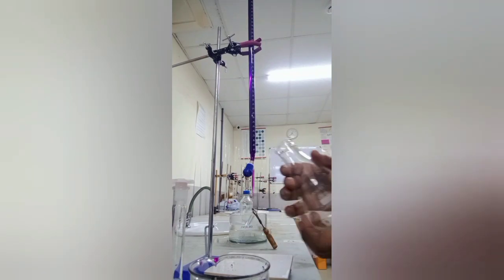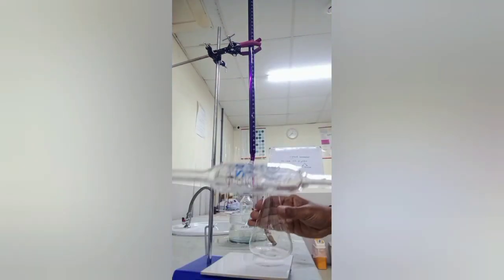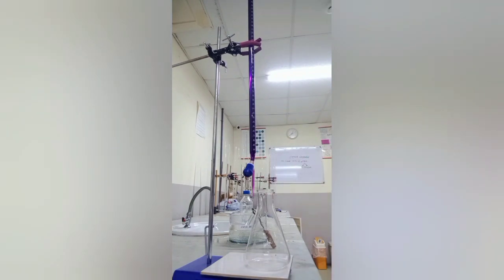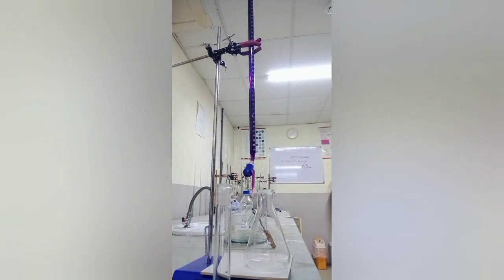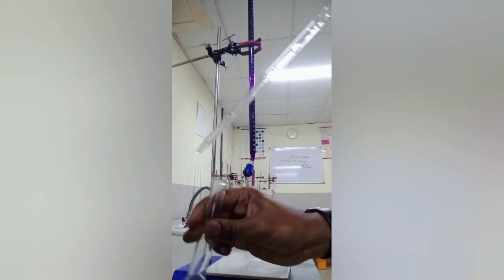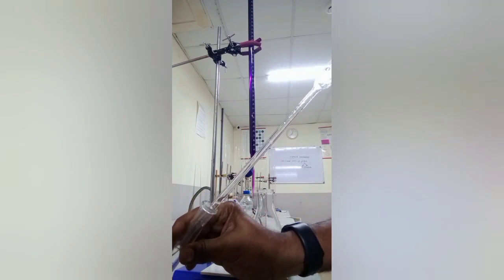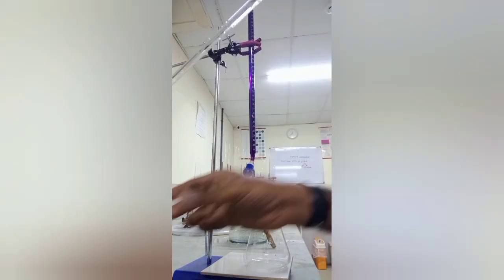In the conical flask, this is the conical flask, we want to take the ferrous ammonium sulfate solution that we prepared. The pipette also you want to wash. Just take a little amount of solution in the pipette, then tilt it like this, and put it in the sink and wash it.